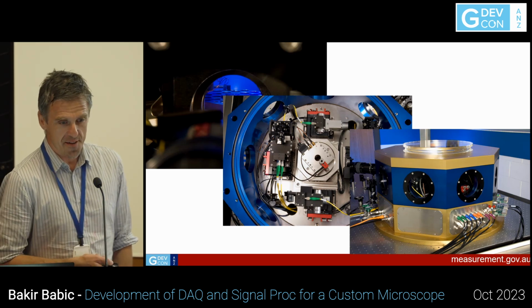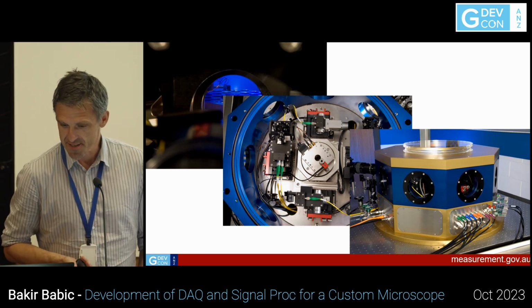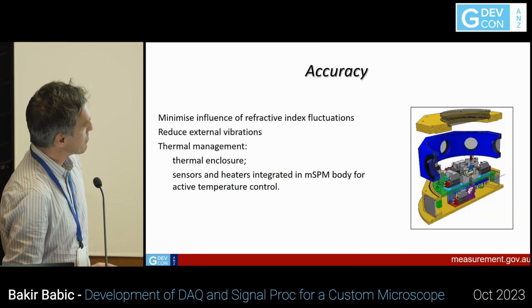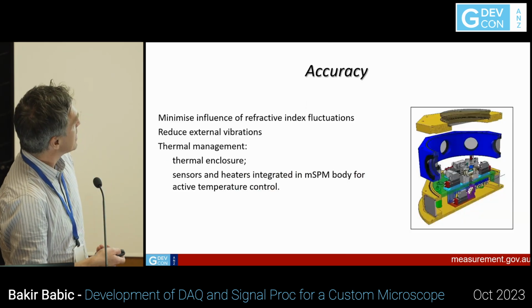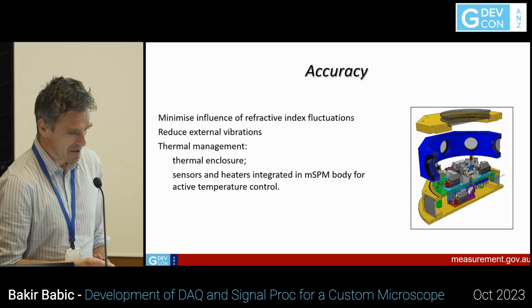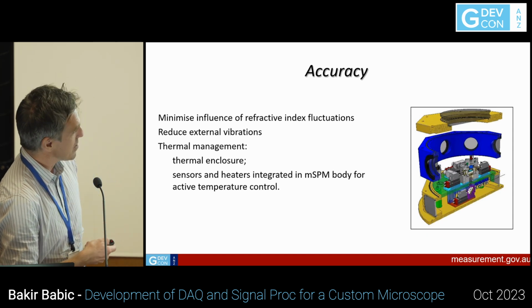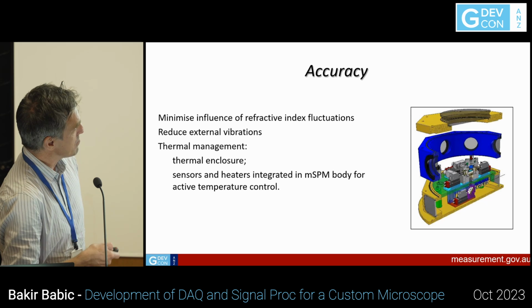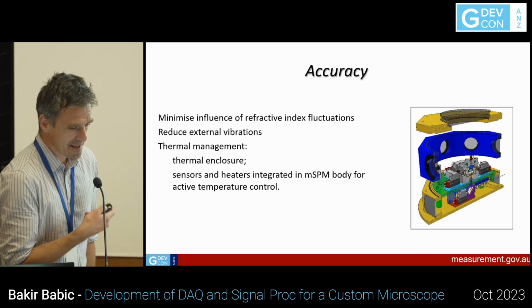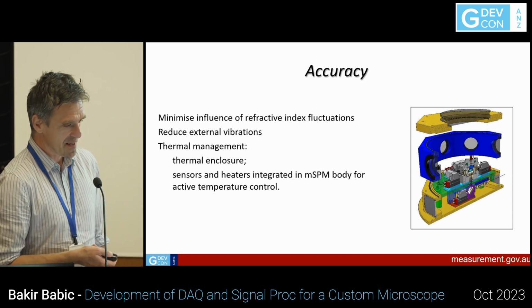So our challenge was really, and we were fortunate enough to have this project going, to figure out how we're going to do the data acquisition, also at the same time monitoring all the signals. So that was really problematic, because if you want to be able to evaluate your accuracy or your uncertainty budget, you really have to take care of, for example, measuring temperature gradient, pressure, humidity, CO2, which all come into, for example, the refractive index of light.